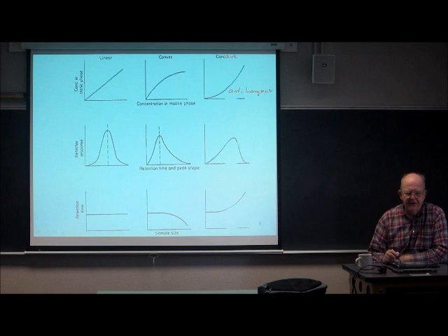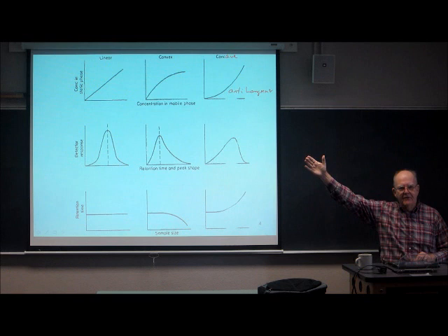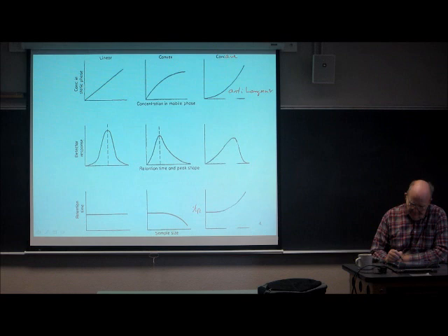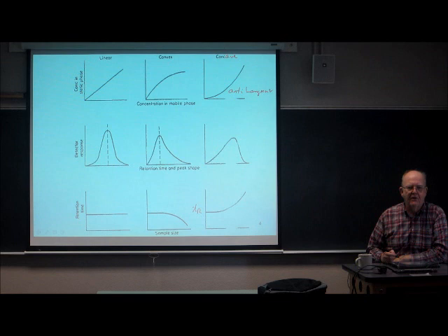So if you inject too much stuff, instead of having a tail, you have a front. And the front eventually can extend all the way into the dead time of the column. And the peak maximum moves out and out, and there's no limit to how far out it can go, theoretically. The retention time, instead of dropping off as you inject more stuff, can shift to greater numbers as more sample is loaded into the column.